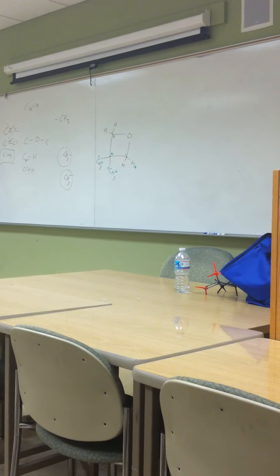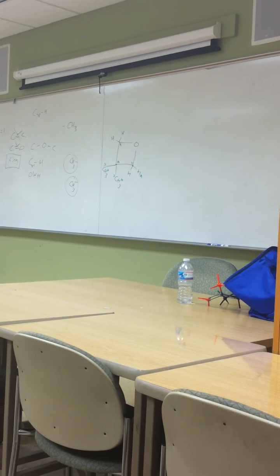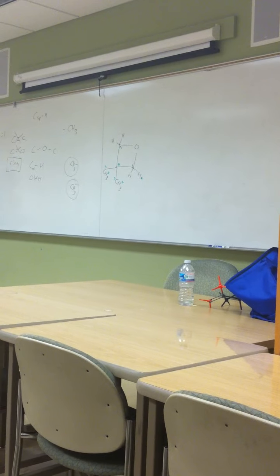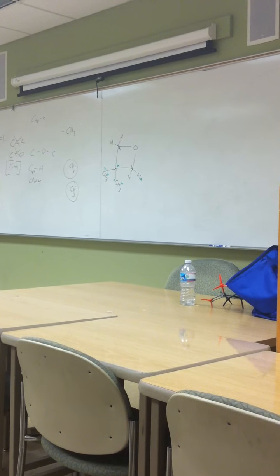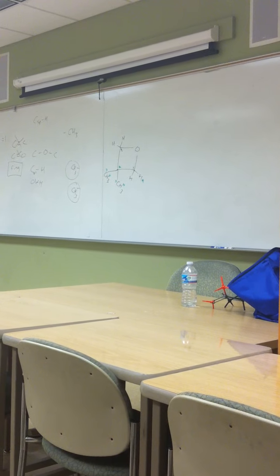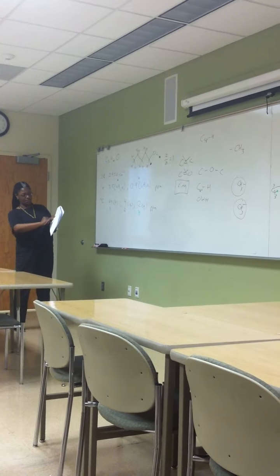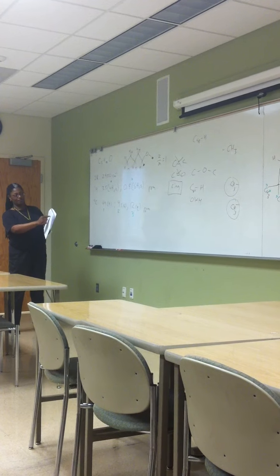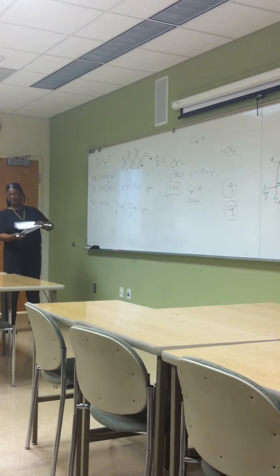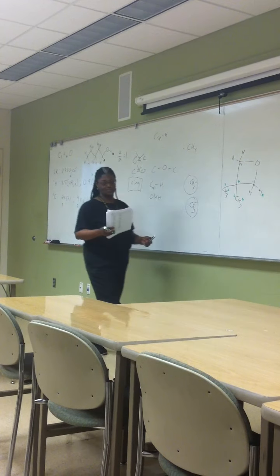Again, it depends on what table you're using, what your expected is. If you put an expected of, for instance, 1.3, then you would need to explain that it's attached to an oxygen, so it's observed as actually 3.5. This is the explain part. If you just used a simple table that didn't show this one and put expected was 1.3, you would need to write as part of your explanation that this carbon was attached to an electronegative oxygen, so it's shifted.